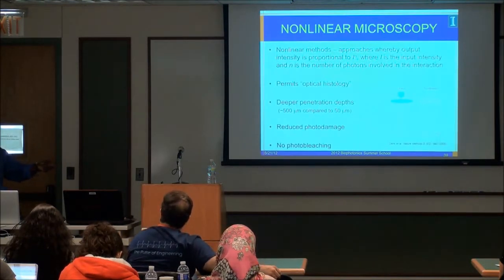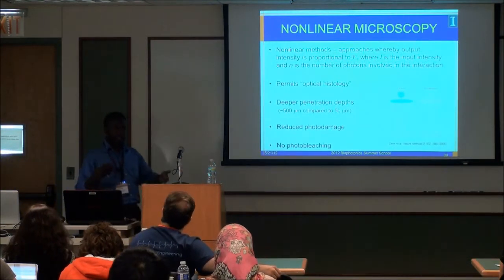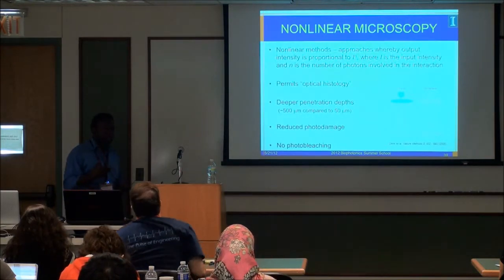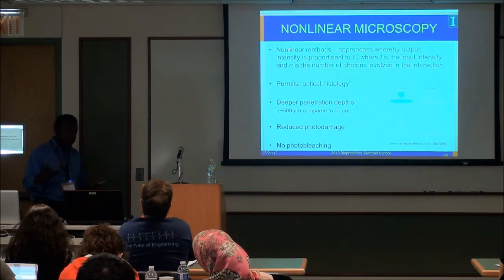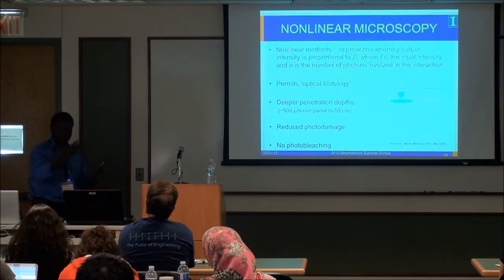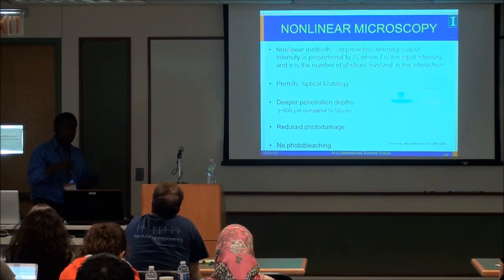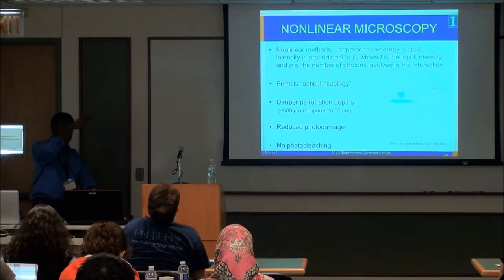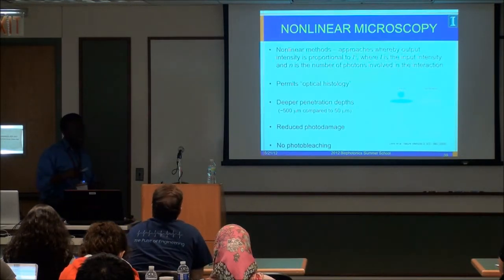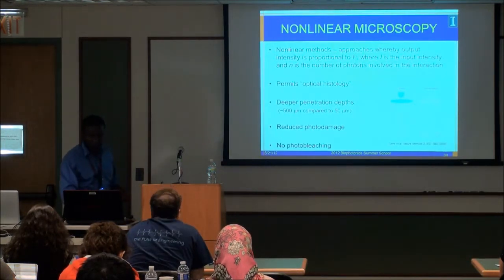There's a researcher by the name of Ogilvie. She's at the University of Michigan in the physics department. She does multi-photon interference. And she shows an image where she's imaging certain types of biological structures, and the stuff that she wants to see is stained with fluorescence, and she gets the fluorescence signal. But the problem is the environment around the stuff she wants to see is autofluorescent. When she shapes the phase using a spatial light modulator, she reduces the autofluorescence relative to the prominent target area. So her contrast actually boosts up. Okay, I can direct you to her work, but it's actually quite smart. No one has actually thought about exploiting that.